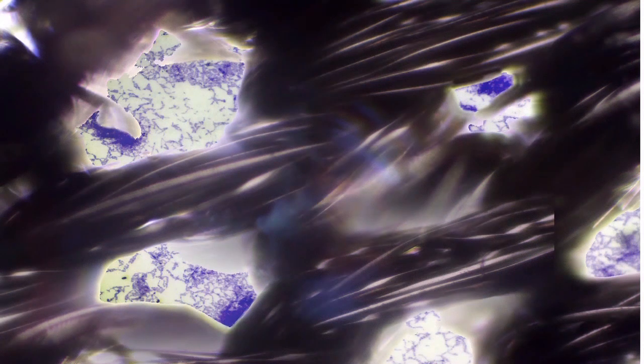Magnified some 750 times, we can easily comprehend the ratio between the size of the cells and the fabric fibers.